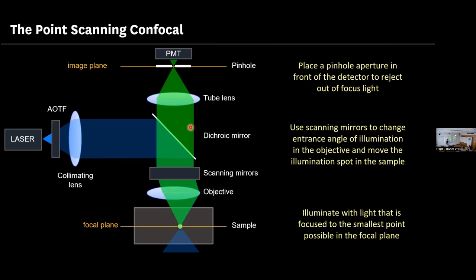There are some cases where you want to use different laser intensity, different laser transmission, only in some parts of the sample. And we'll see in the second lecture why that is. But you can do that. So this is just a very fast way of changing the laser transmission, of changing the laser illumination power in the sample. But the laser is always emitting at 100%. So you're not prolonging the laser life by using it at 10% transmission. You're just saving the sample from extra light.